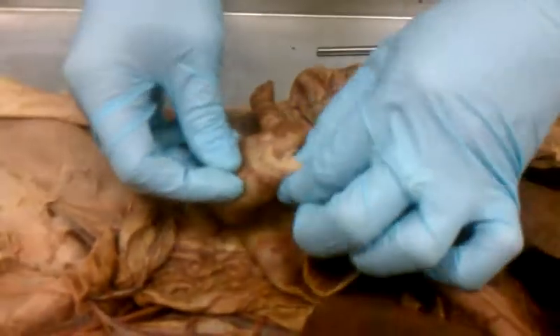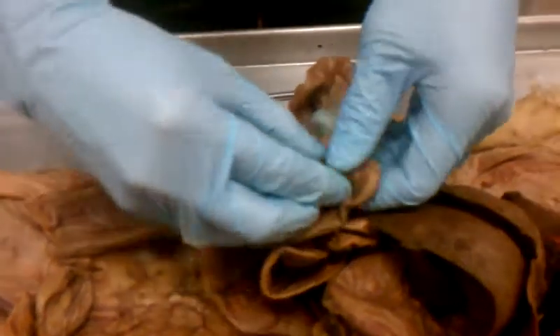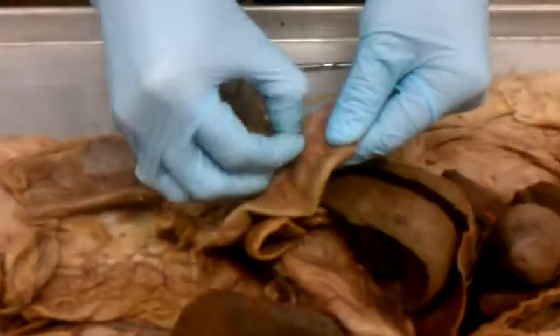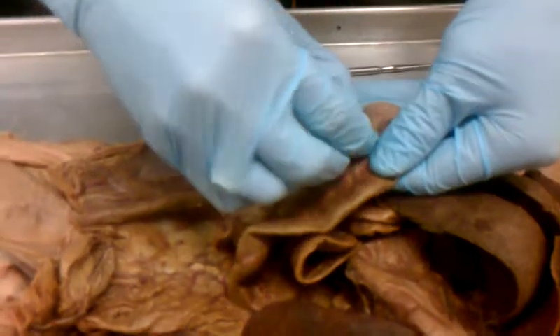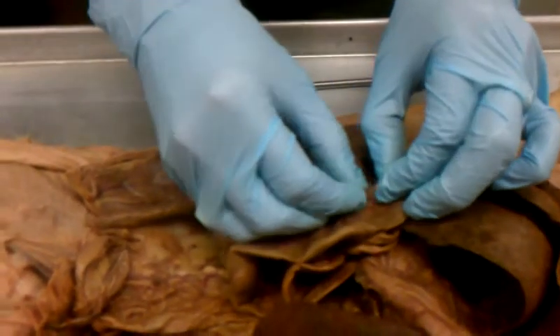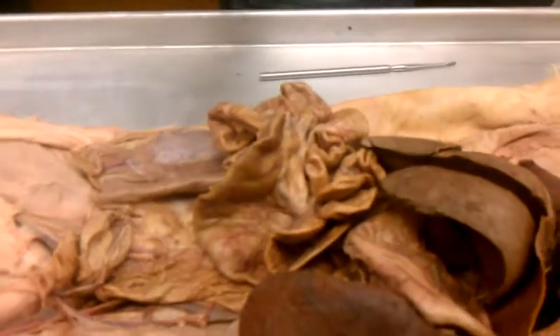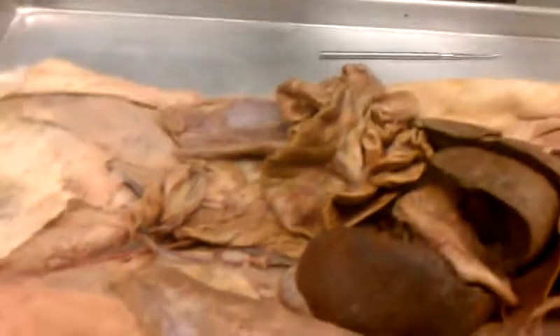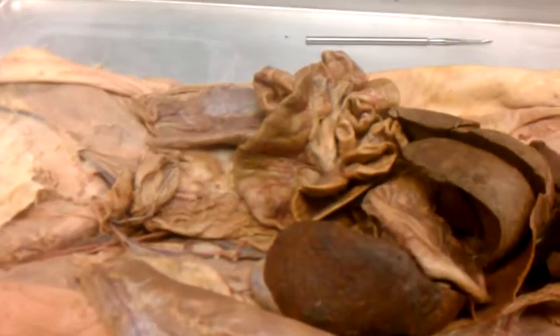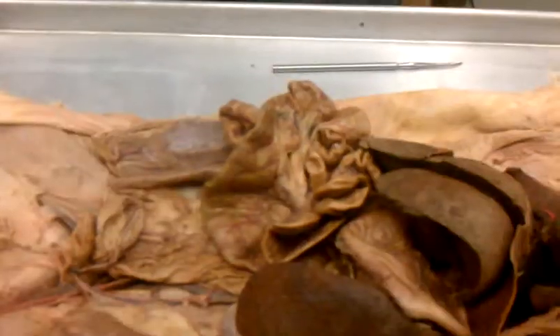Okay, then let me see what we got. So then we need to find the appendix, which we haven't dissected all this out. I don't know what the other lab used then. So for right now, until I dissect this out, you need to go to the cecum, and the appendix is actually going off of the cecum. Looks like a little tail coming off of the cecum.